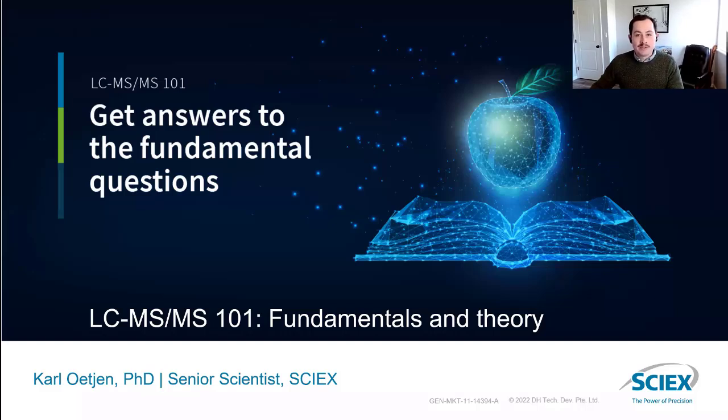So today we're going to be really talking about some of those fundamentals. The way I designed this talk was to focus on folks who maybe are new to mass spec, or someone who has been doing some mass spec and just wants to refresh on some of the key variables in mass spectrometry.